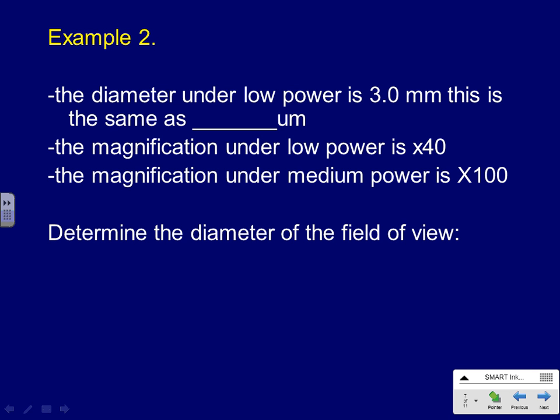We're doing the same thing. How many micrometers is our low power field of view? If we had 3 millimeters across there, yep, 3,000.